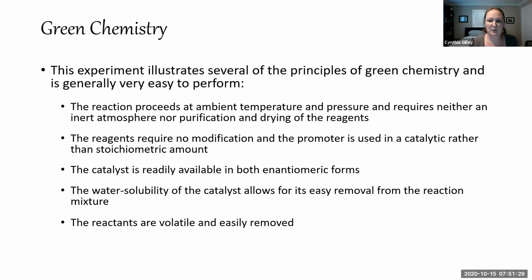the reactants to work. It requires neither an inert atmosphere, which basically means that you can run it open to the air. You don't have to use a nitrogen gas atmosphere, nor purification and drying of the reagents. So they're able to do the polarimetry on the crude product. The word crude basically means that the product is used without purification beyond an extraction.